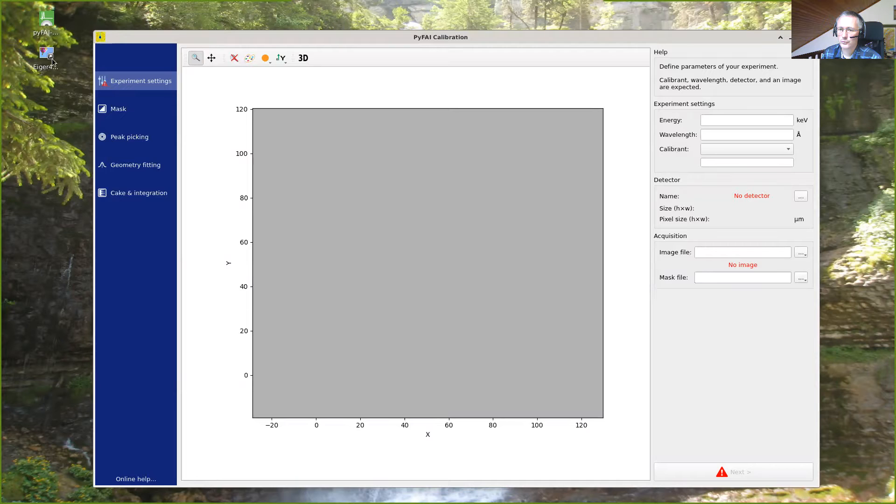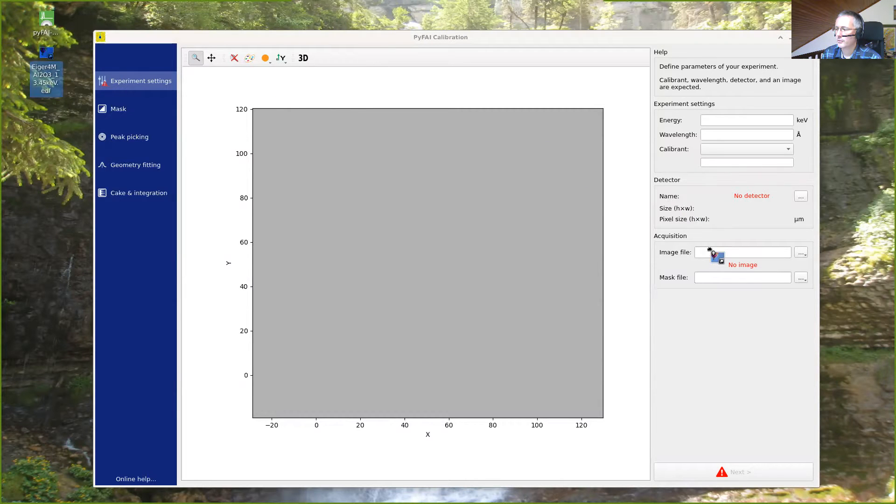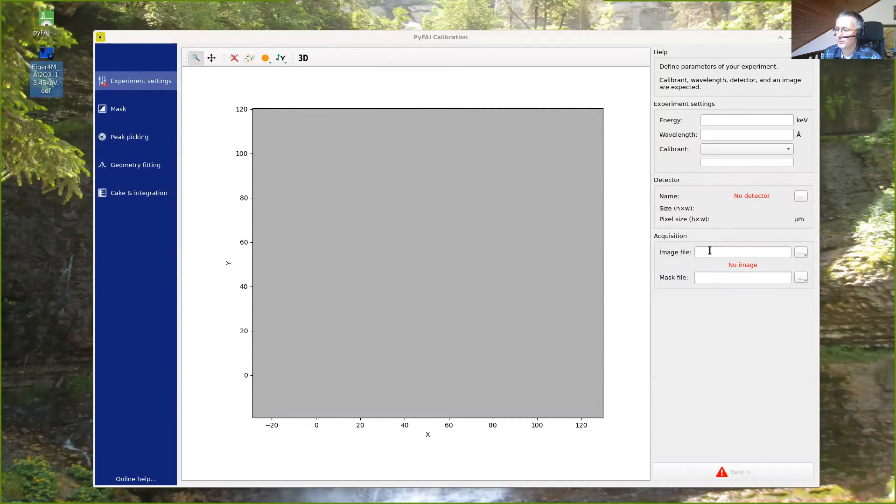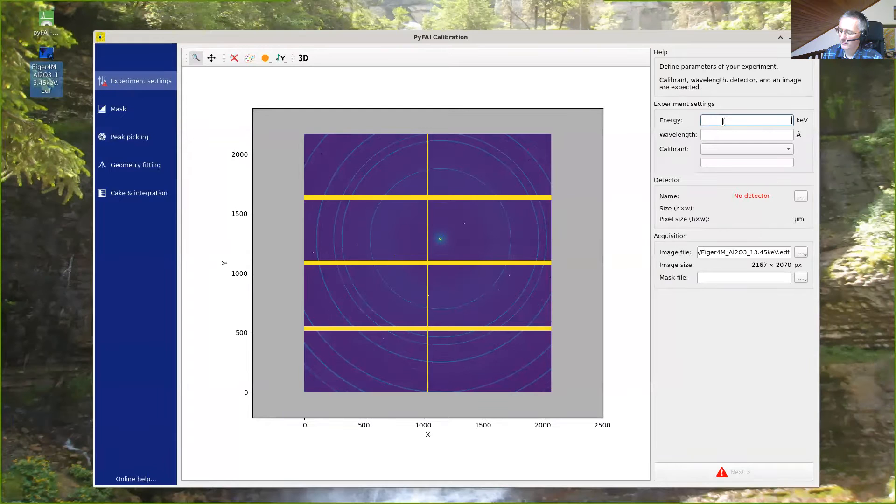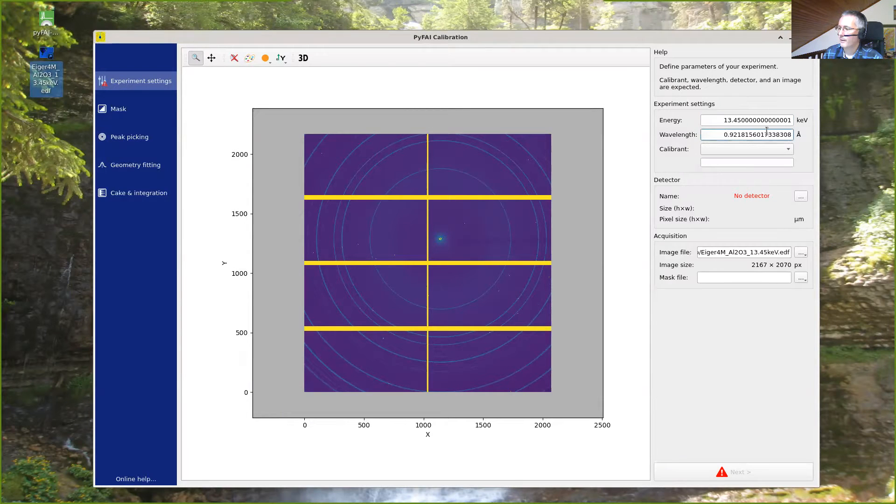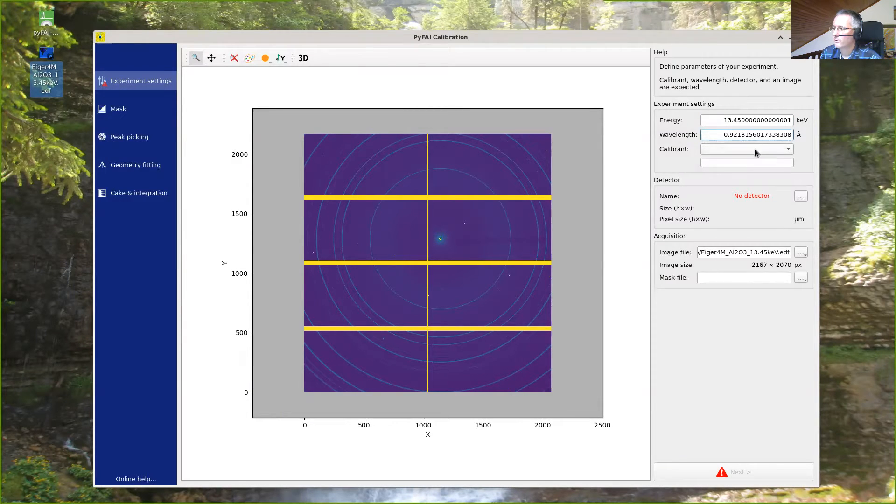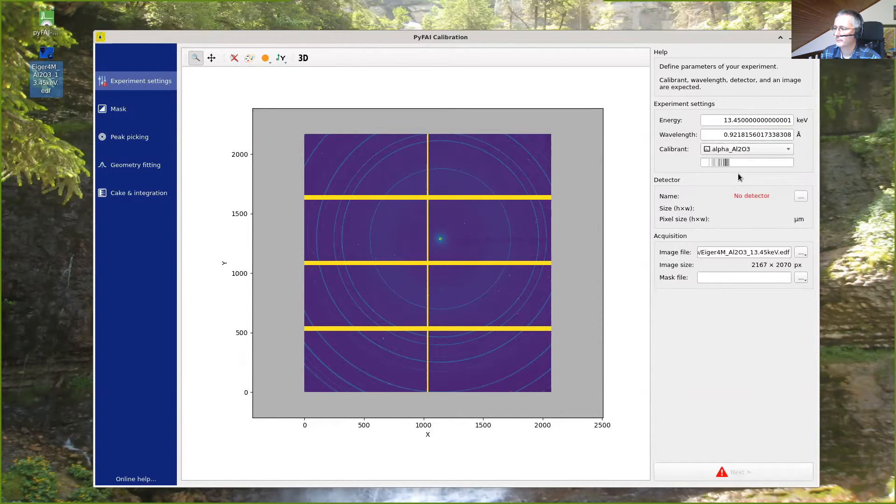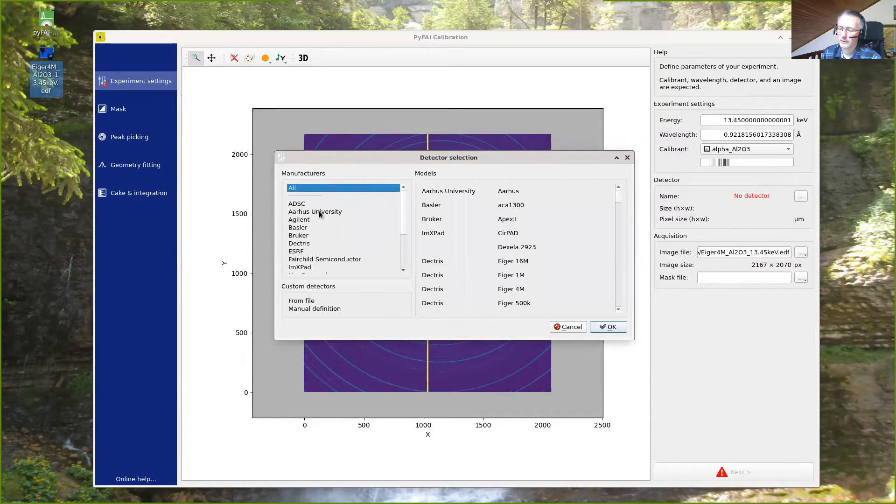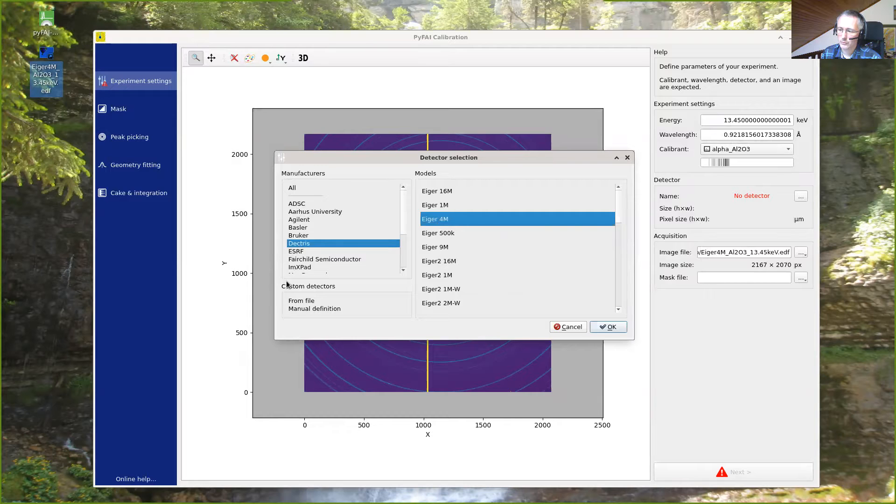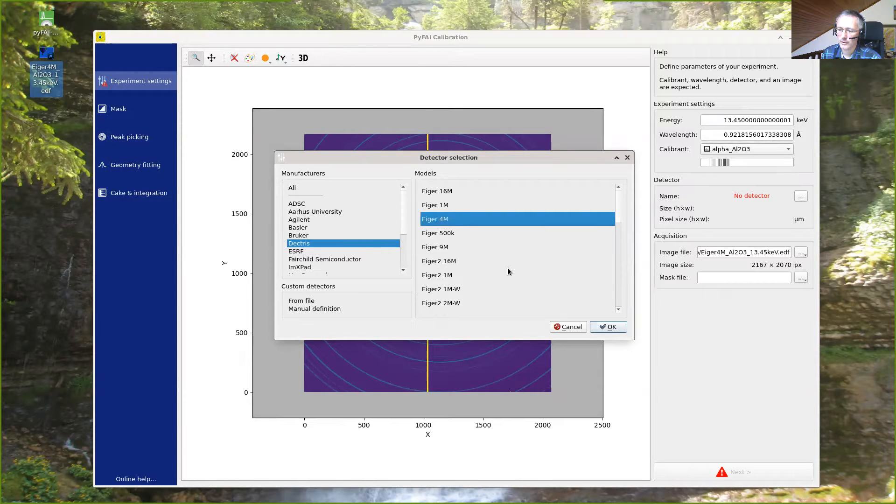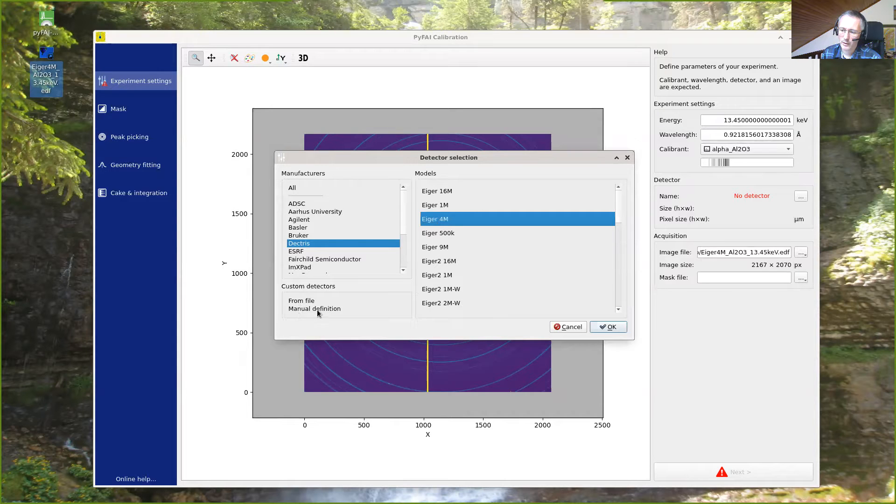To load the image we can drag and drop the image to the image file button here, so the image is opened automatically, and we can register the energy, 13.45, and the wavelength is calculated automatically. The calibrant is available from this pull-down menu, and the detector can be chosen. We can select the manufacturer and the model. Most of the detectors are available via this pull-down menu. You can also do manual definition of detector if you wish.